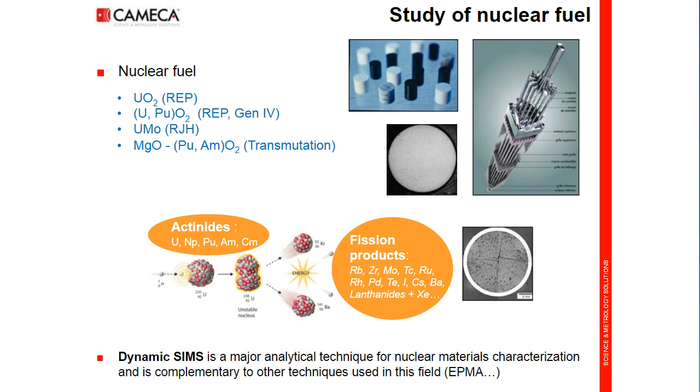Dynamic SIMS is considered to be a major analytical technique for nuclear materials characterization and is complementary to other techniques used in this field, such as EPMA.